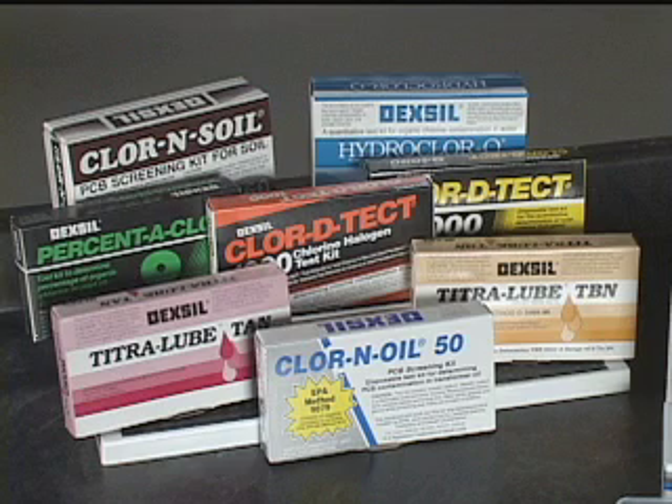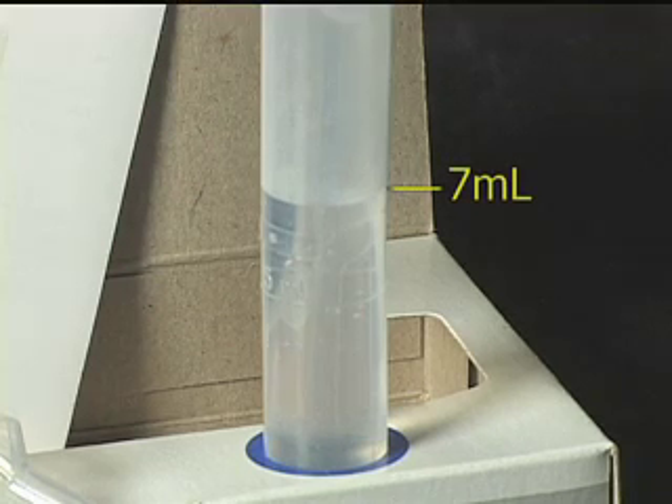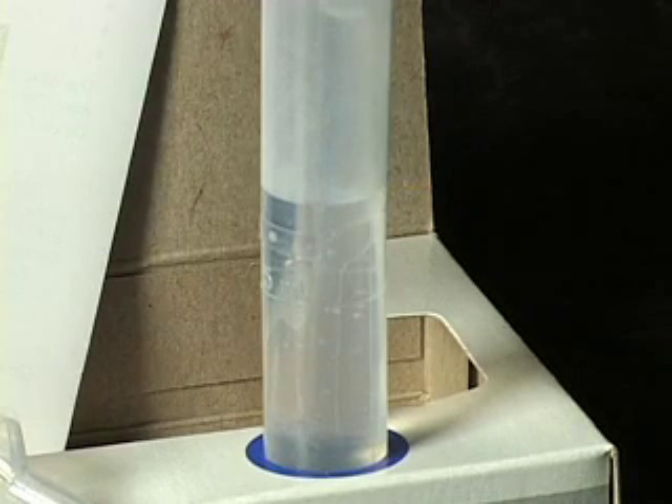Quality control is of utmost importance at Dexel Corporation to ensure that our products always provide our customers with consistent and accurate test results. However, there are circumstances where shipping conditions can cause the test kits to lose the free aqueous solution in Tube 2. Tube 2 contains 7 milliliters of an aqueous buffered solution. During air transportation, a reduction in air pressure in the cargo hold can force out some or all of the free buffer solution.